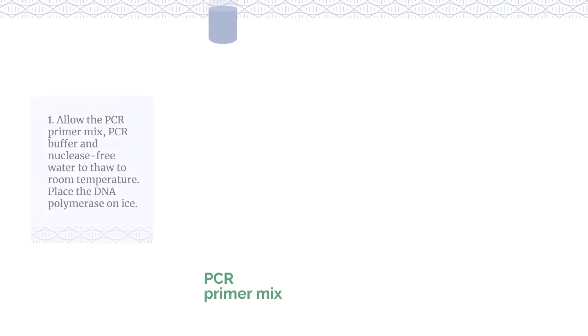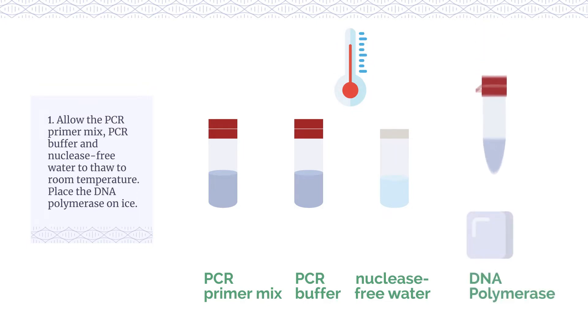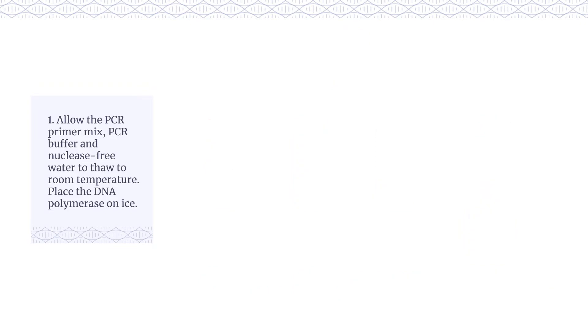Allow the PCR primer mix, PCR buffer and nuclease-free water to thaw to room temperature. Place the DNA polymerase on ice.